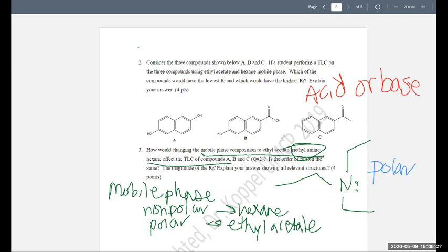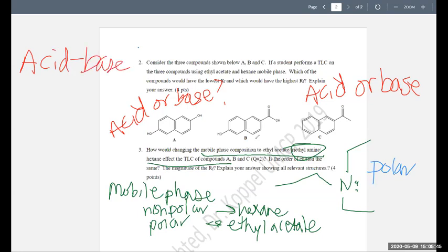So this brings it back to the extraction experiment. An acid plus a base gives you a salt, an ionic salt, and water. And here, you also classify these: are these acids or bases? So what happens if I do an acid-base reaction? Is it possible? It seems weird that you would do that on a TLC plate itself, but it can happen. So your question is, can an acid-base reaction happen on the TLC plate while you're doing this?